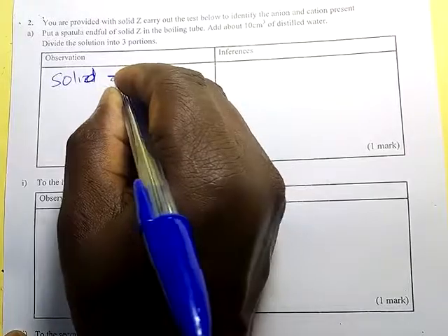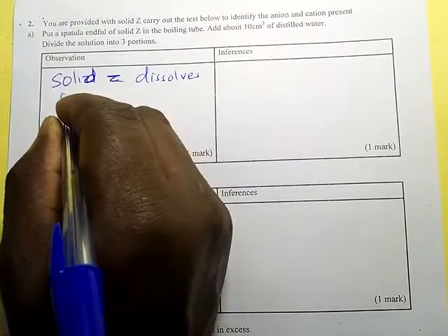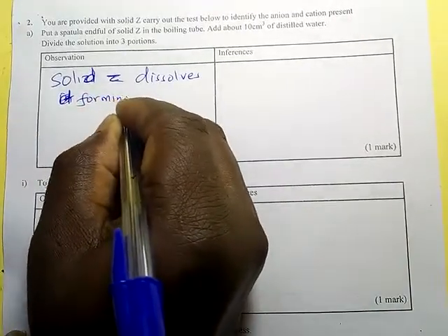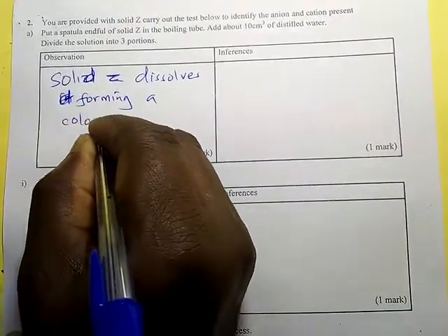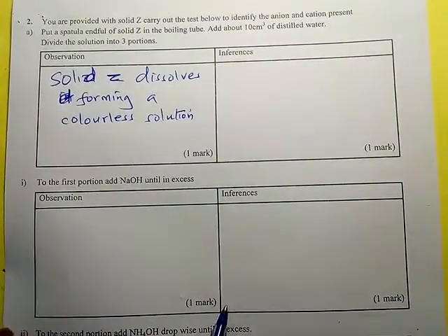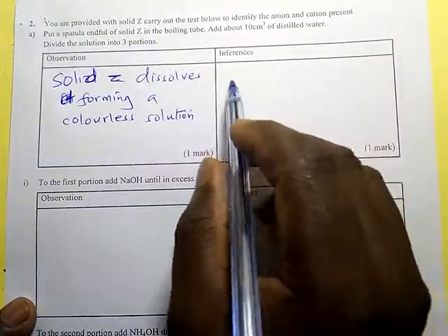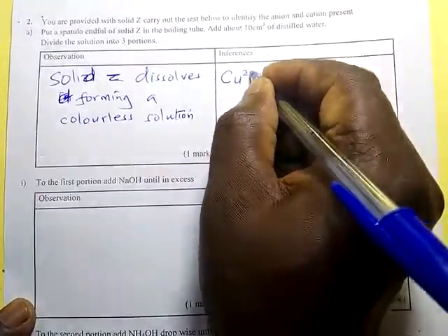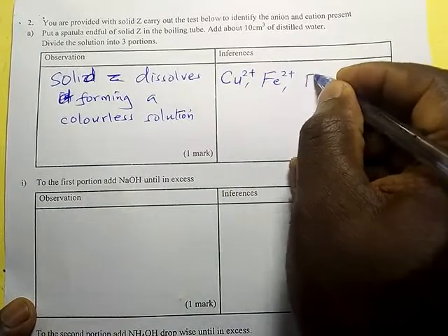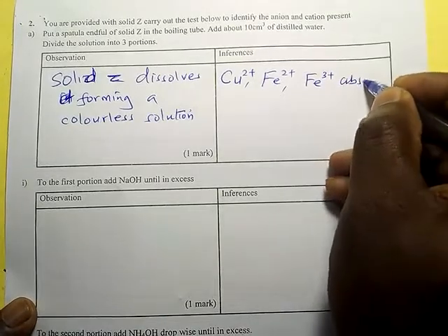Solid Z dissolves forming a colorless solution. So we know that we don't have the colored ions. So we can say that Cu2+, the copper ions, which is blue, the iron 2+, which is green, and the iron 3+, which is brown, are absent.